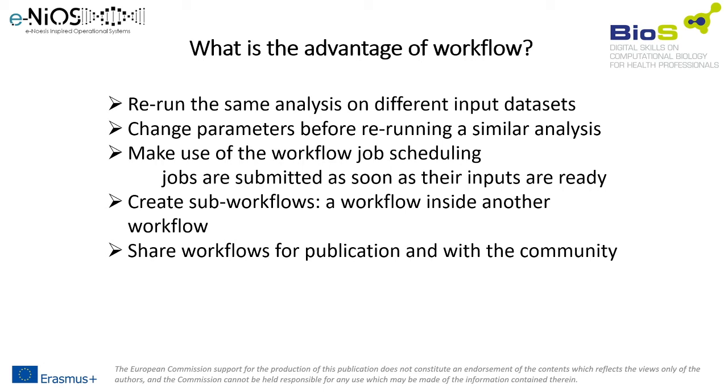Here are a few workflow generation benefits you can count on. You can rerun the same analysis on different input datasets by reducing the manual entry and request handling. You can change the parameters for one or more tools before you rerun a similar analysis.